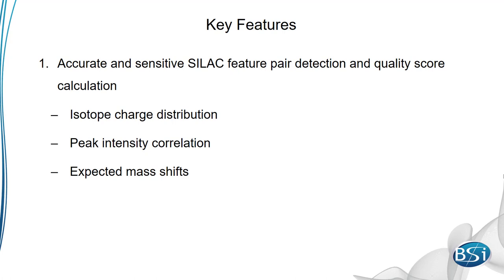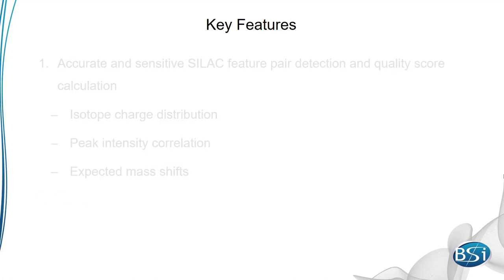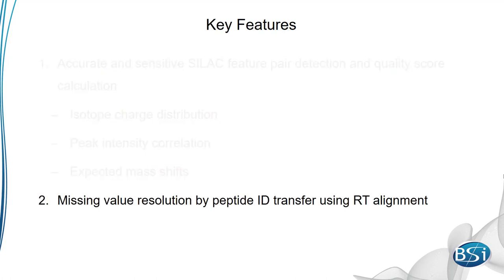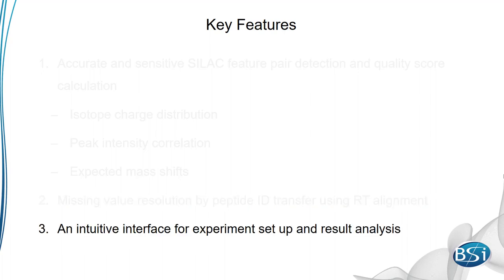Also, using retention time alignment, transfer of IDs across samples to similar peptide features is possible. Perhaps most importantly, PEAKS-Q for SILAC includes an intuitive interface that allows you to easily visualize and understand your quantification results.